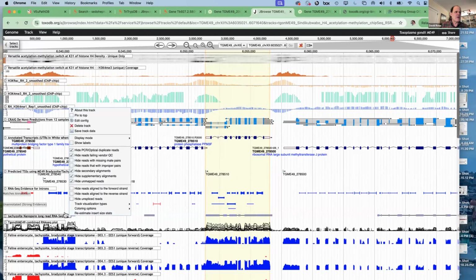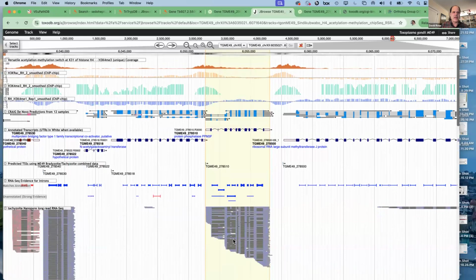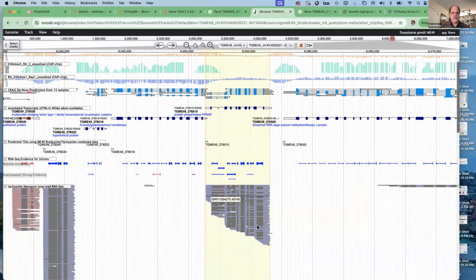Now, having described that, let's take a look at some of the other information, including information that Omar had mentioned. Let me take a look at the long-read RNA-seq data. And what I can see from long-read RNA-seq data is that despite the fact that these are supposed to be full-length transcripts, most of them probably are not. Even in this nanopore experiment, the reverse transcriptase often fell off before it got to the 5' end. I can see evidence of frequent intron read-throughs.